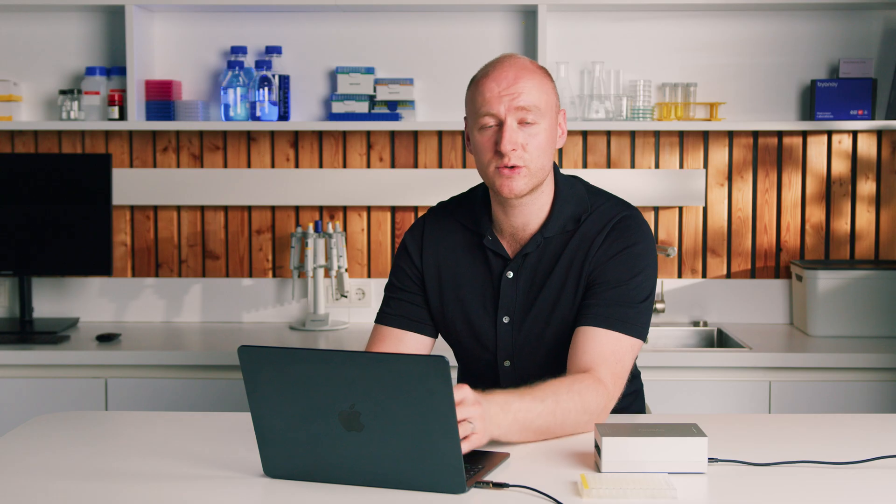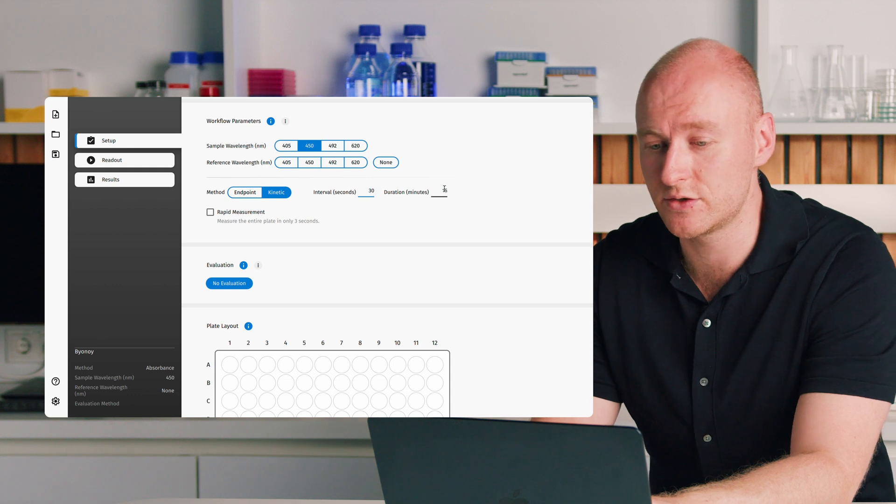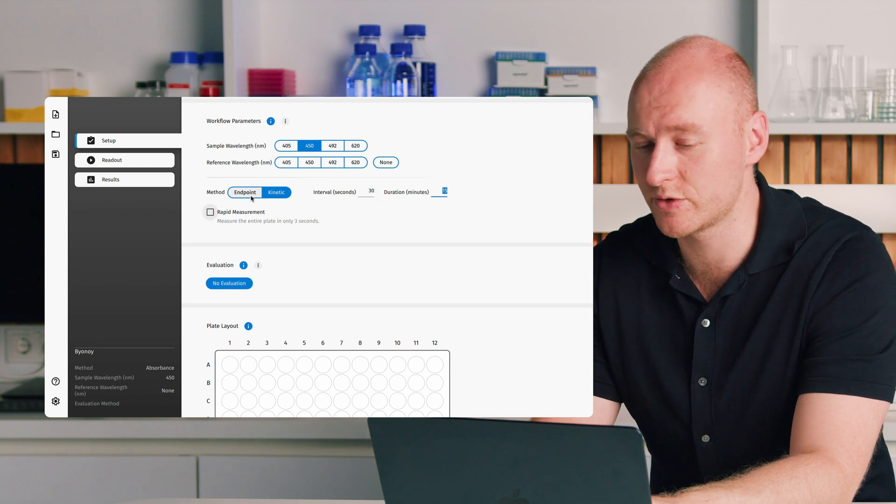Then we have our method, where you can select between endpoint or kinetic. Endpoint means a reaction has already taken place and you want to measure at the end. With a kinetic experiment, you take several measurements over a certain time course, setting your interval and duration in the software. We'll stick with endpoint for the purposes of the demo.